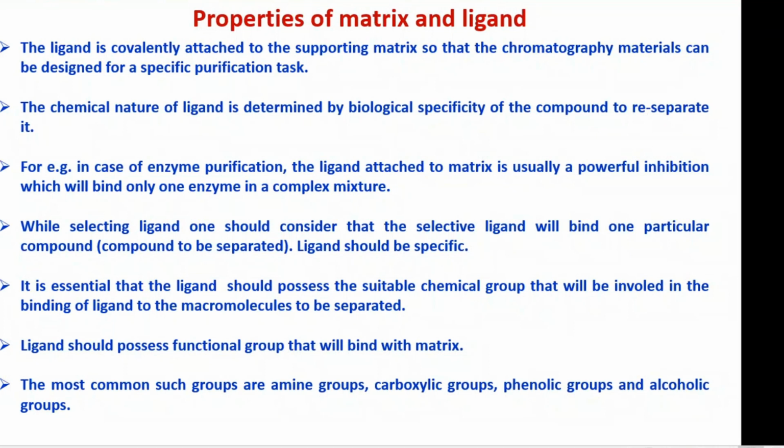When the substrate molecule is there, we are adding the enzyme molecule to separate. When the enzyme molecule encounters the substrate molecule, the enzyme will go and bind to the substrate. What is the reaction that will go on when the enzyme binds with the substrate molecule?